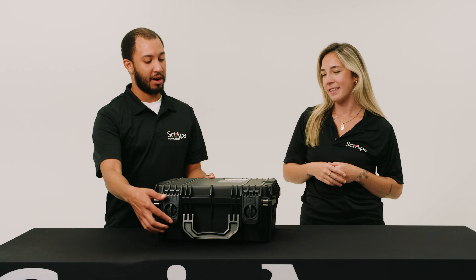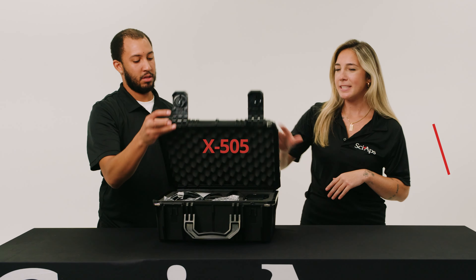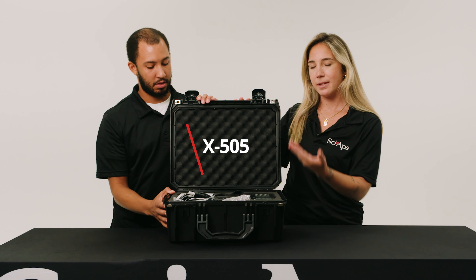Today we have an X505, included in its nice sturdy Pelican case.